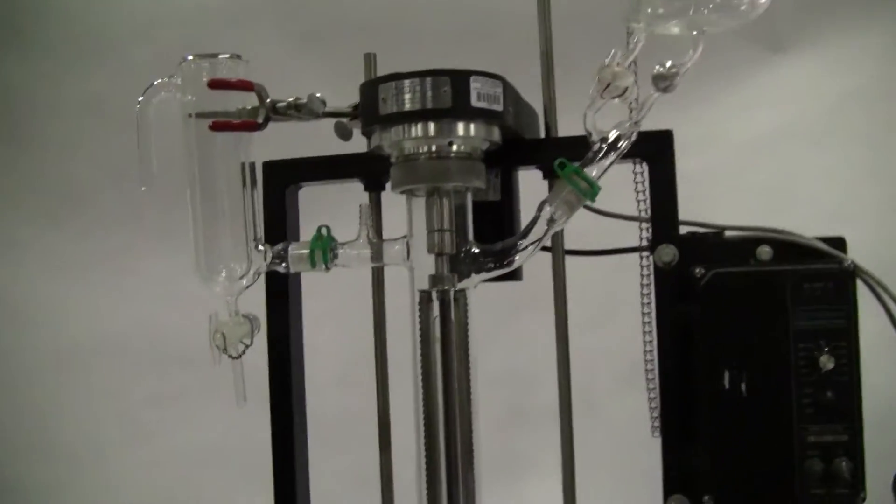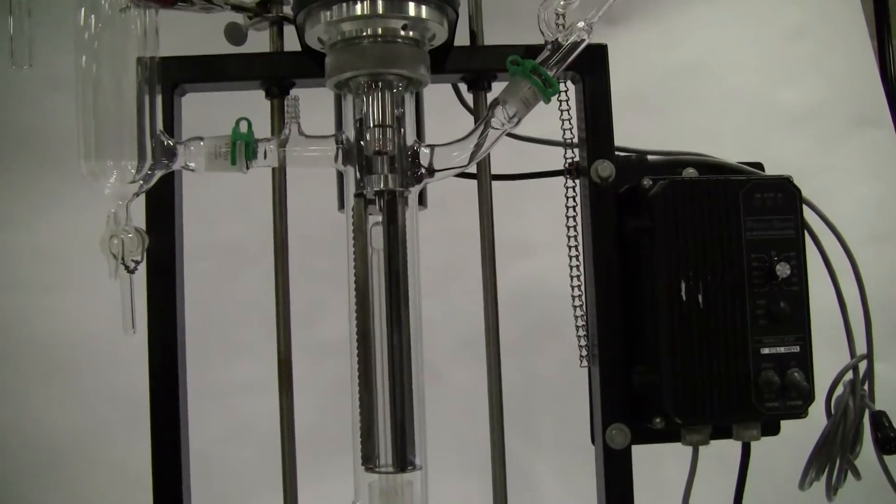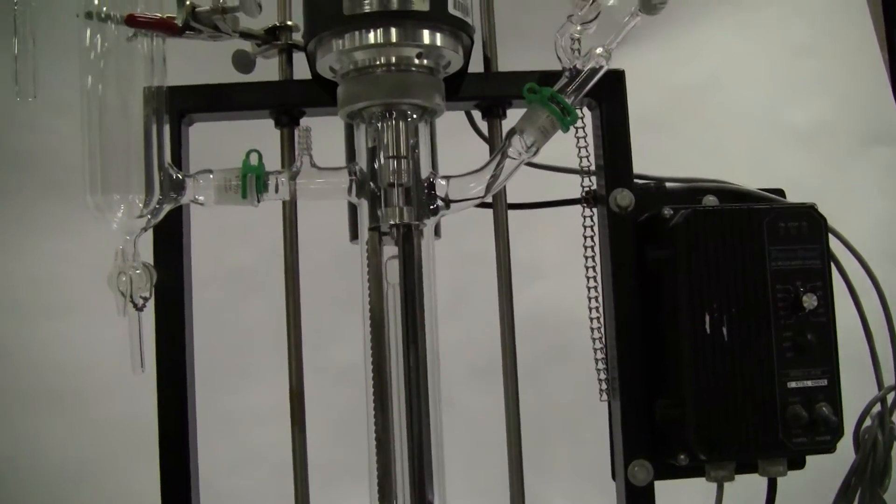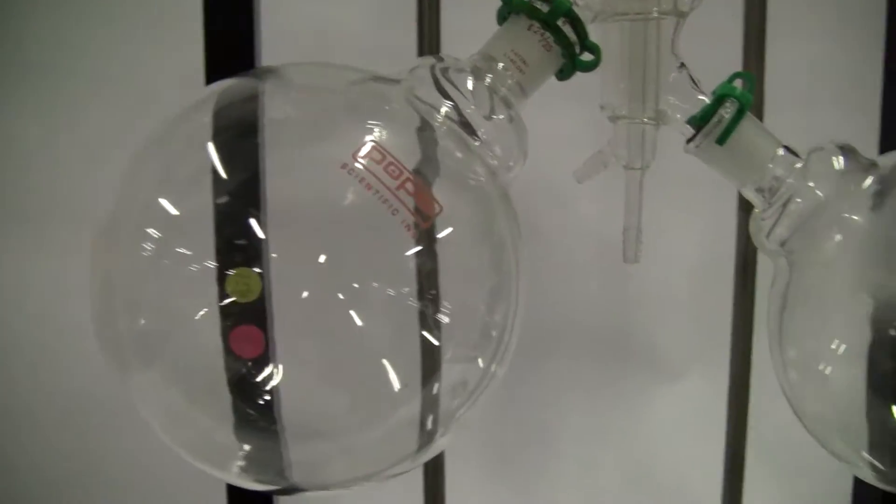Hi, this is Michael from Hitech Trader. Today we're looking at a Pope wiped film evaporator. Two receiving flasks at the bottom.